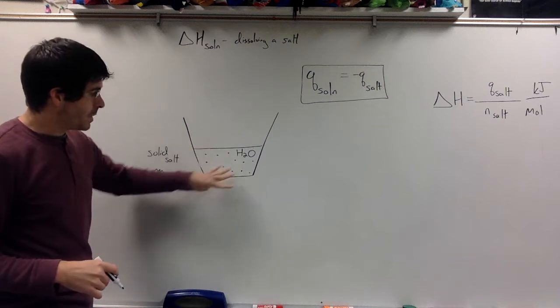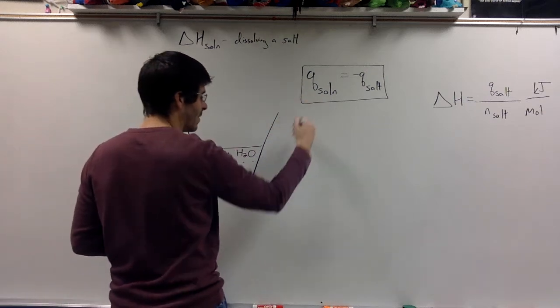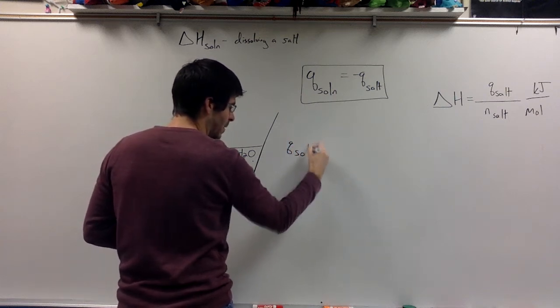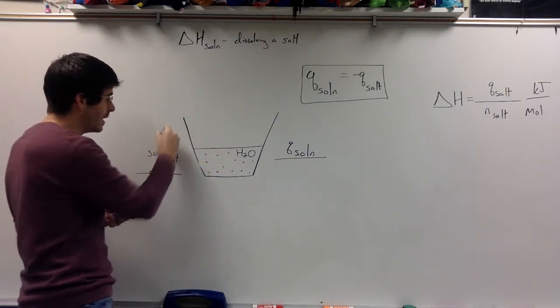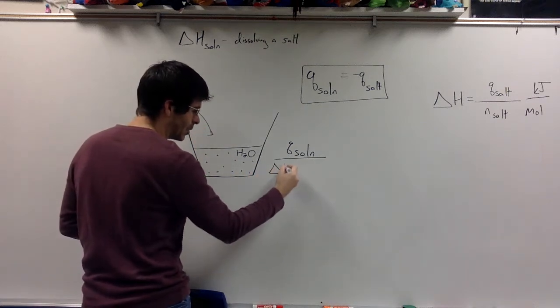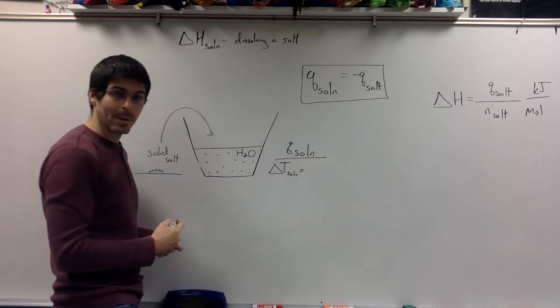Now, our solution here, since the water is part of our solution, we have to take some measurements to get the heat of our solution. This solution is very similar to what we've done because it's water-based. We just have the solid salt in it. We put that in and it dissociates. But we take a temperature change of the solution. That's easy enough with a thermometer.